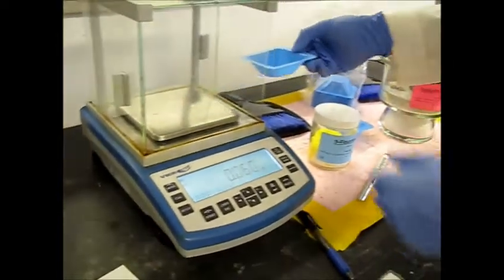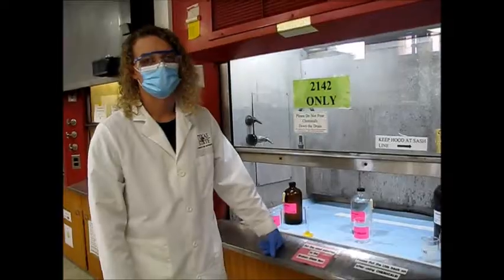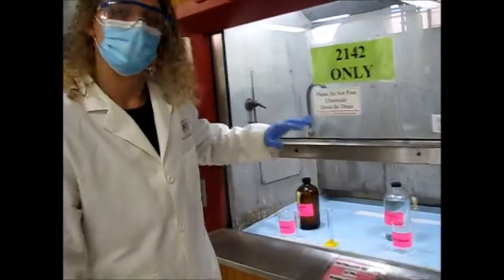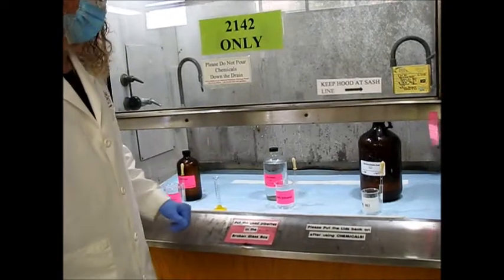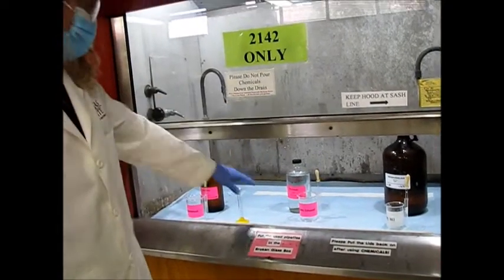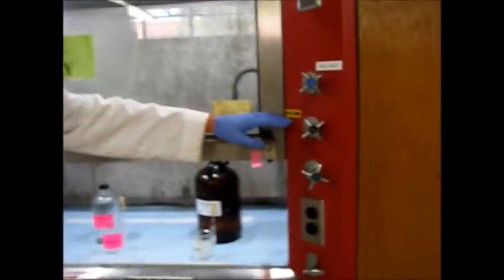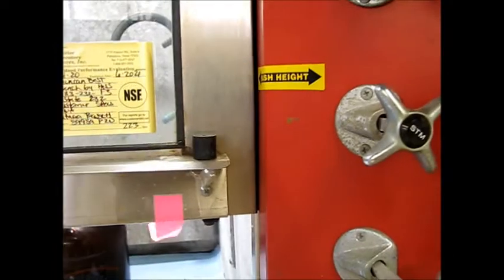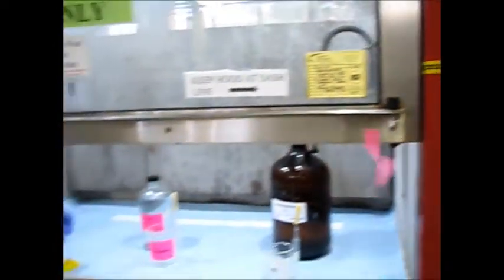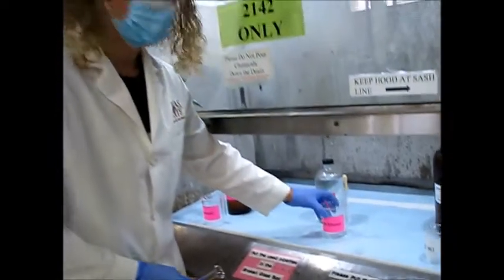Next we'll go ahead and measure out the volume of ethanol for our solvent. We normally keep all of our liquid reagents in the fume hood for y'all to measure out. It is important whenever you're getting your chemicals that you keep this hood below the sash height. It says it right here. We need to make sure that it's at or below this line. These are all of our liquid reagents we're going to use for this lab. Right now we just need ethanol.